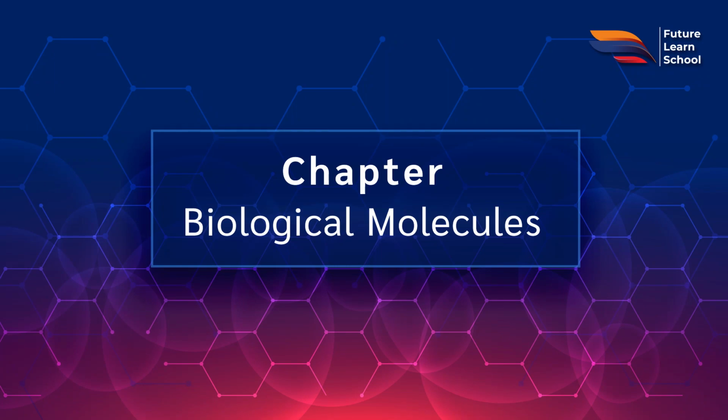Assalamu alaikum students, Ma'am Sadaf here, and today we are going to perform a confirmatory test for the presence of carbohydrates, and then we will discuss the categories of carbohydrates, like reducing and non-reducing sugars, which are present or not.